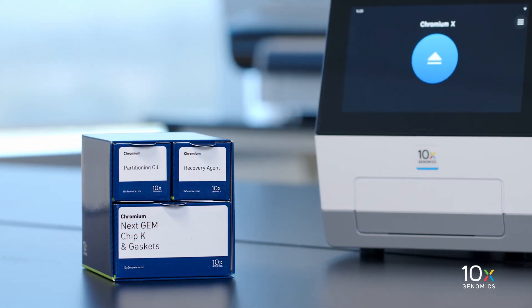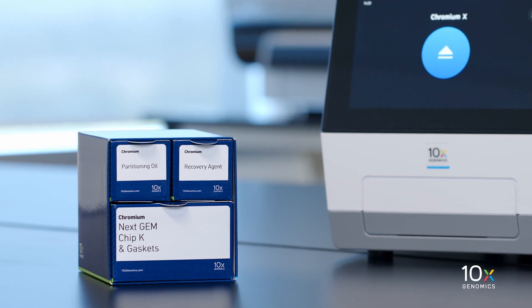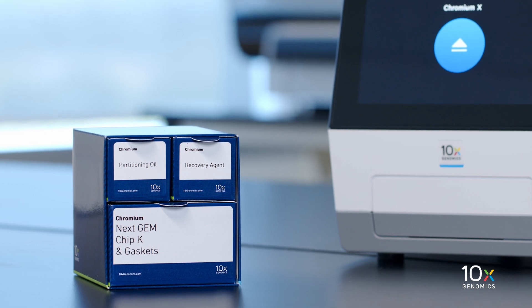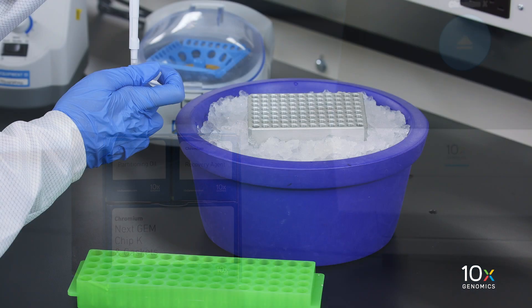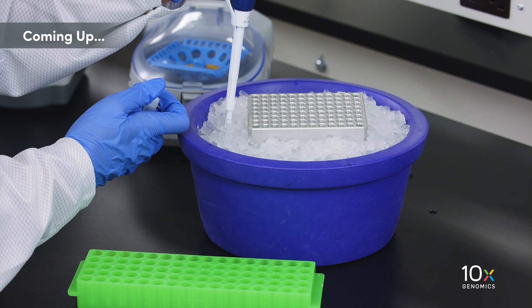Finally, the Chromium NextGem Chip K Single Cell Kit is stored at ambient temperature and contains Partitioning Oil, Recovery Agent, NextGem Chip K, and Gaskets. We now have all of our reagent kits ready, and next we are going to prepare the MasterMix.